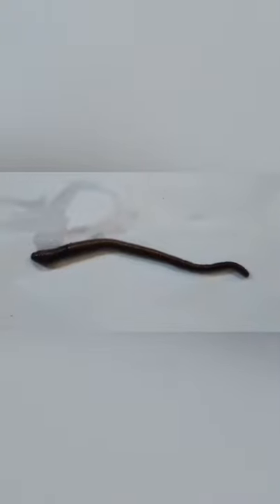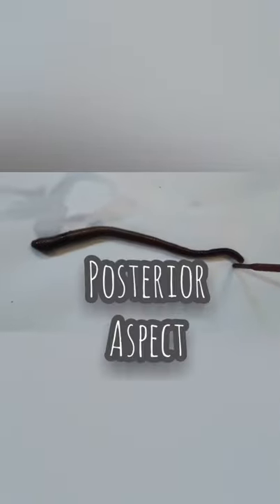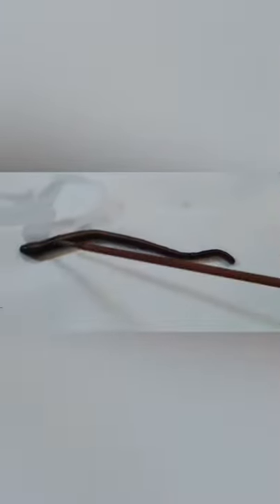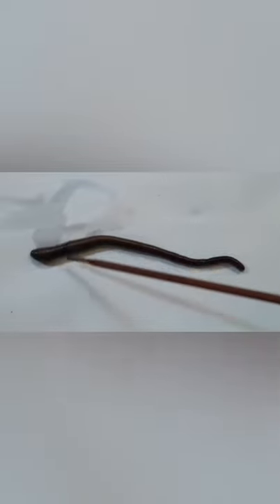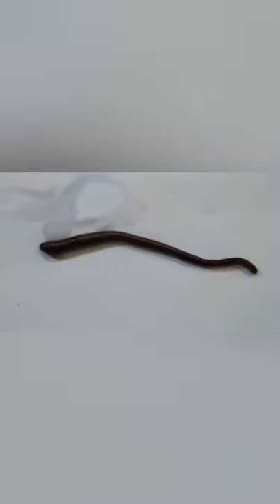So what we have here is an earthworm and today we're going to dissect it. Before we dissect it, we must know its external parts. The part here is the posterior aspect where we can see the long intestine and its anus over here. And the part here where we can see the dark spot is the clitellum. And the part here is the anterior aspect where you can see most of the body organs of the earthworm.